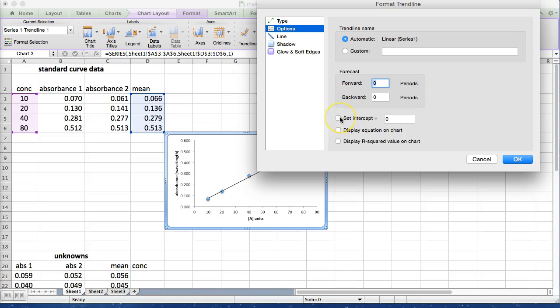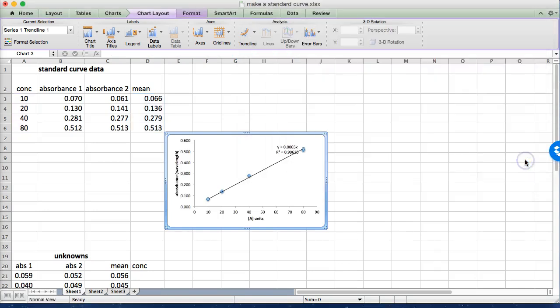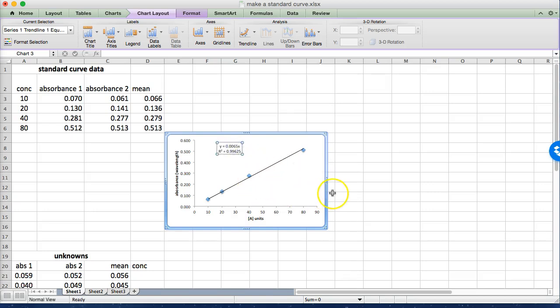Now we're going to set the y-intercept to zero. We know it's zero because in this case we actually used a blank to zero the spectrophotometer. We want to see the equation because we're going to use it and we just like to display the r-squared value and see how good a fit we have.